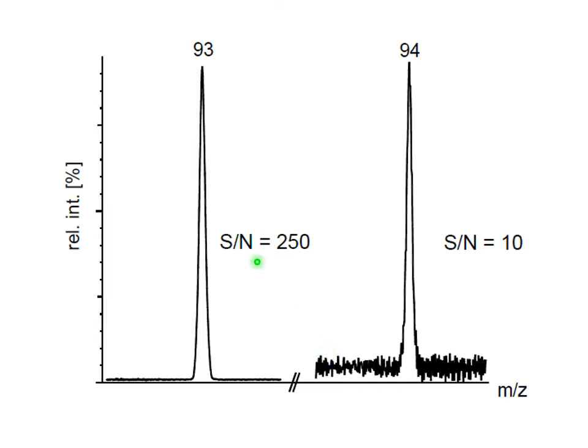When signal is strong and noise is small, you have a beautiful picture of your signal. When signal to noise ratio is small, you see a noisy background and the shape of your peak can be corrupted. Very small signal to noise ratios will result in ambiguous peaks.